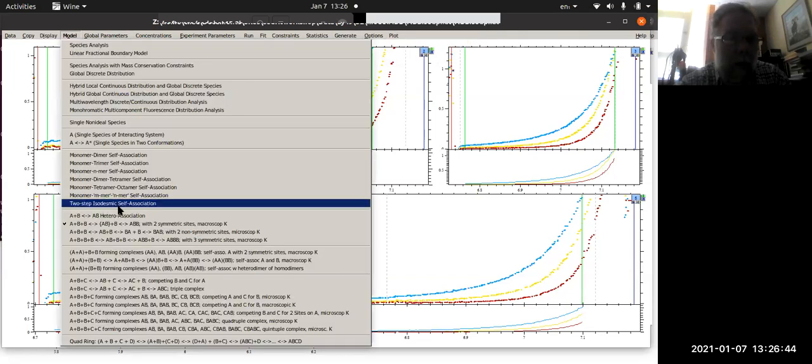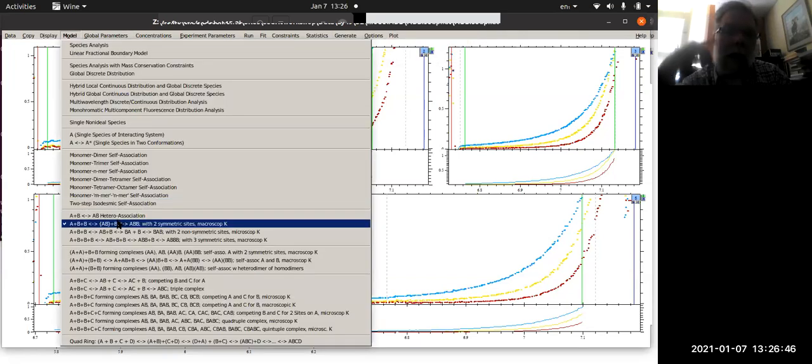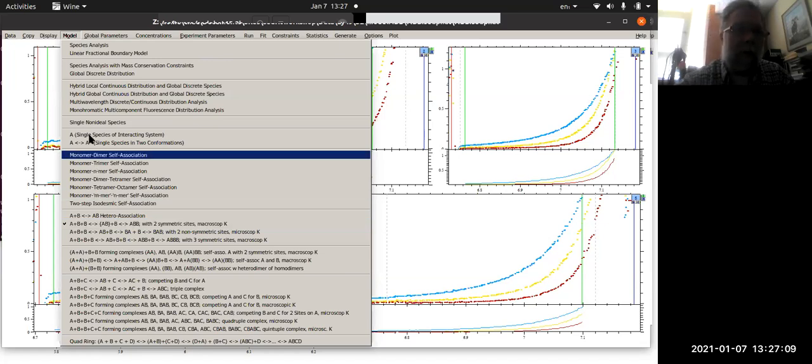If you pick the correct model, and you should note that this model has been pre-populated because the configuration that SedPhat saved stores all of the information from your best fit model with all of the data in it, and all of the fitted parameters are all lumped into that one configuration. So when SedPhat crashes, hopefully you've updated your configuration.